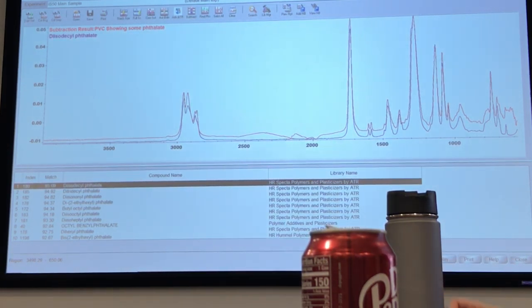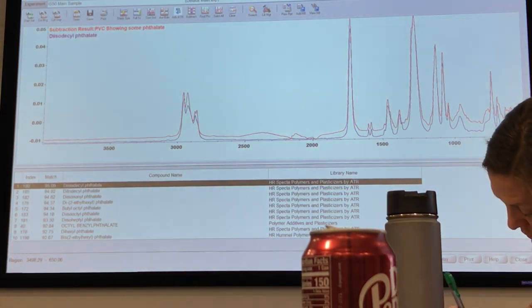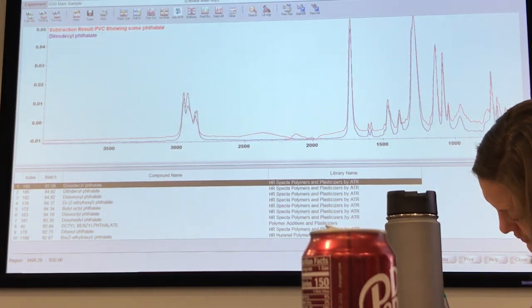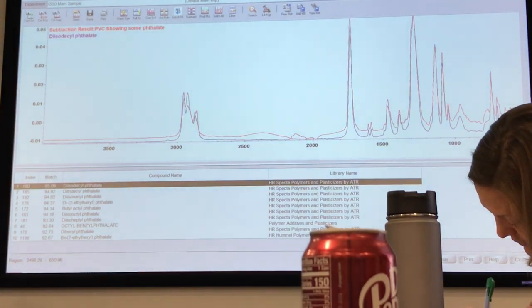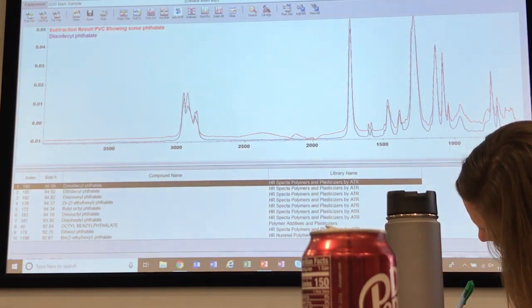Colors are the other things, right? A lot of you may want to look into characterizing colors, because when you look at colors which are mixed into polymers, if it is at 1 to 5% and above levels, you can easily subtract the main polymer out and see what colors were added into that particular polymer in exactly the same way. The same is true with other additives like calcium carbonates, calcs, anything like that. You can do exactly the same.